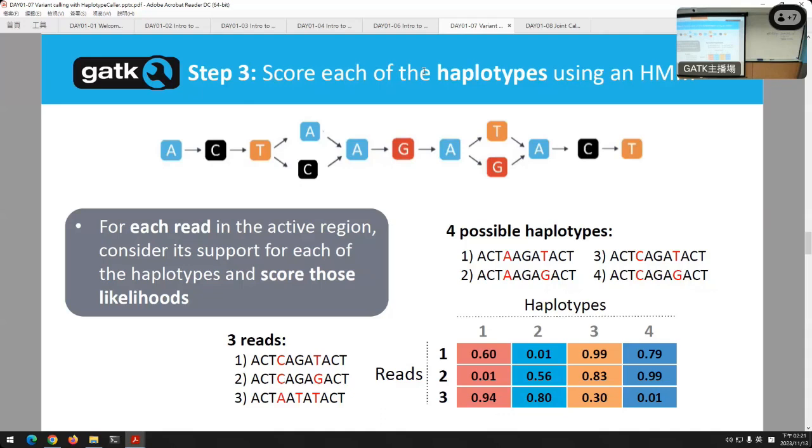Read 3 has an A and a T and a T. So there are 2 differences on that one. But who knows, that difference could be low quality. Could be that this base was a Q10, whereas it matches on the first A, and that A could be a Q40. That's where the base qualities come in. It's a toy example, a good question, but these things really happen. Other questions?